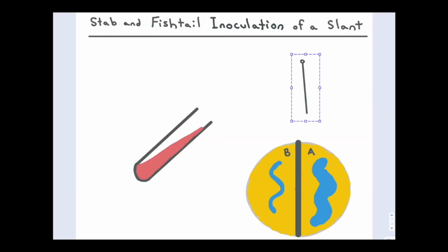And by the way, you would never, ever put these loops on a table. That was just there for demonstration before being immediately thrown away. You use the loops immediately after taking them out. Don't even let them sit in the air for a few seconds. Immediately after you take them out from their storage container, use them.